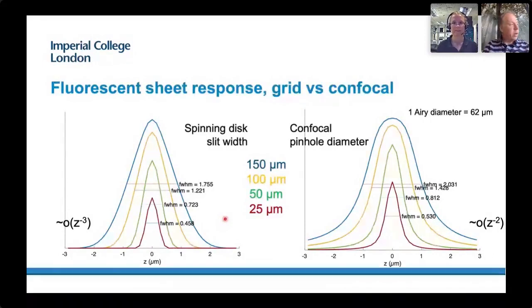And one of the big issues that you start seeing is that if you reduce your signal level, particularly in something like the spinning disc, one thing I didn't talk about here is that the spinning disc system is a subtraction system. So we're looking at the differences between two images. We're subtracting out the optical blur, but we can still see the noise associated with that optical blur.